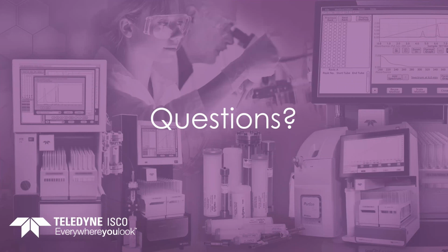Does the co-solvent affect the calibration? And the answer to that is no, it doesn't, because if the compound elutes earlier, we just calculate a lower gradient, and if it elutes later, we calculate a gradient with a higher co-solvent composition.